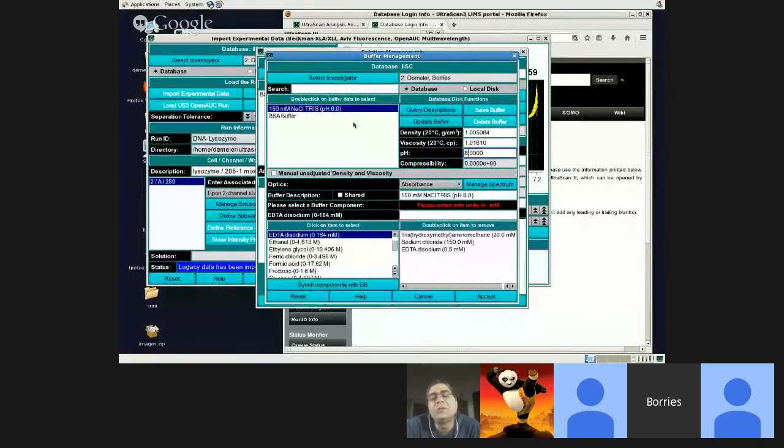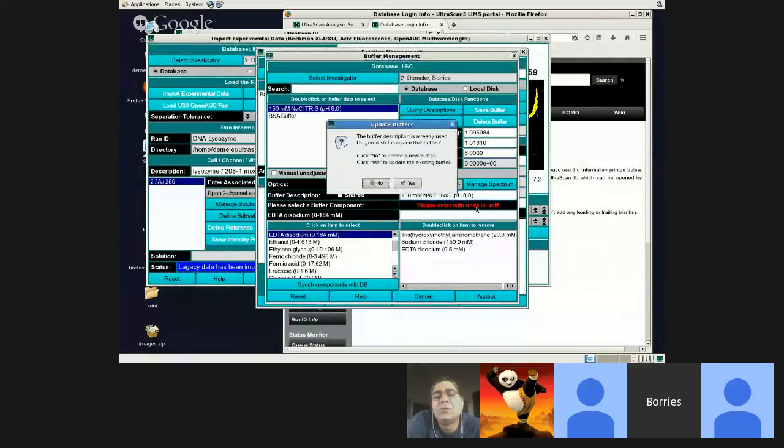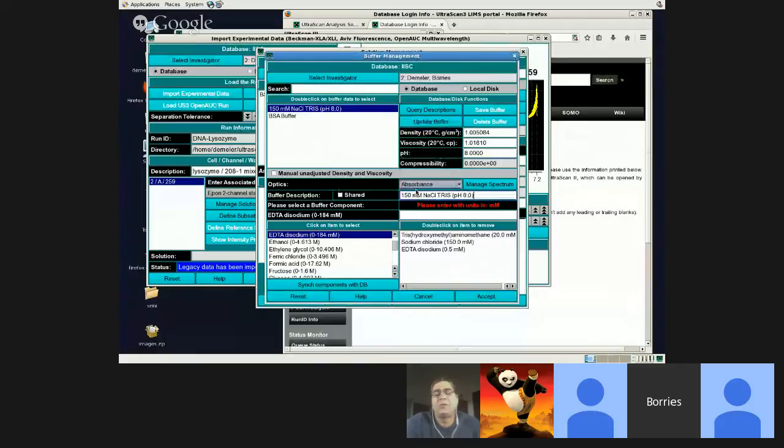So this is just something to keep track of for the user, what pH this experiment was done in. So you're quite correct. I should have updated that. I could also do it here, and then of course I need to resave the buffer, right? And that's what it just asked me to do after I hit enter here. So let me just update it. There we go.